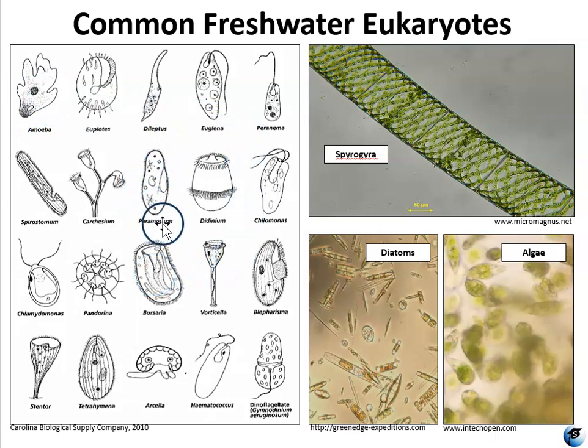The paramecium here, these guys are just covered in cilia and they move very, very fast. These guys that have one flagella at one end, they move a bit slower and they whip back and forth. Things like this and this guy here, they kind of swim around in circles. So you could see any or all of these things. It really just depends.